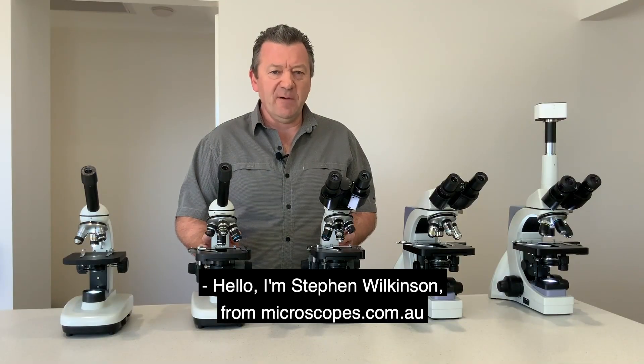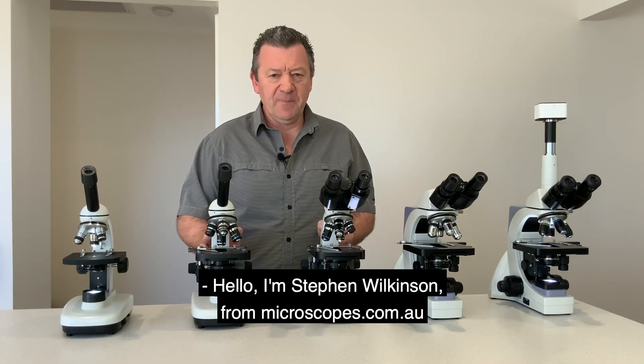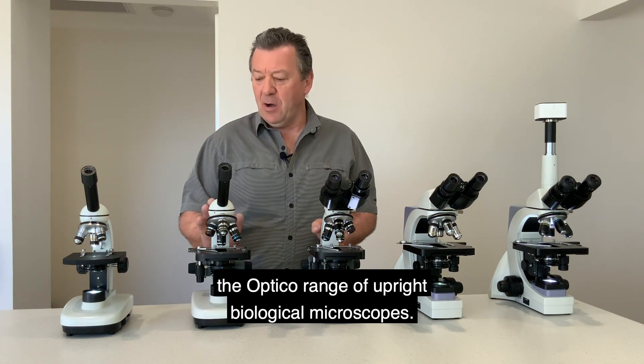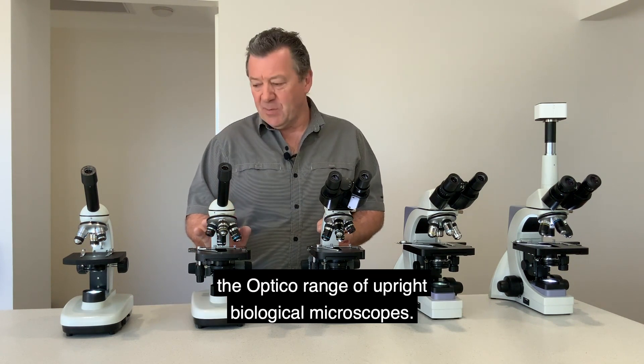Hello, I'm Stephen Wilkinson from microscopes.com.au and today I want to demonstrate to you the Optico range of upright biological microscopes.